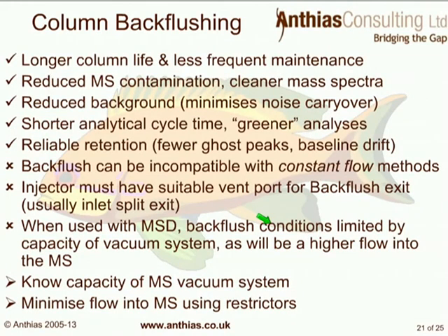Unfortunately, though, backflushing can be incompatible with some constant flow methods. The injector must have a suitable vent port for backflush exit, so usually we can only do backflush with a split/splitless inlet or PTV. And when we're using a mass spectrometer with backflushing, we're very much limited in terms of the flow rate for backflushing by the vacuum system of our mass spectrometer.